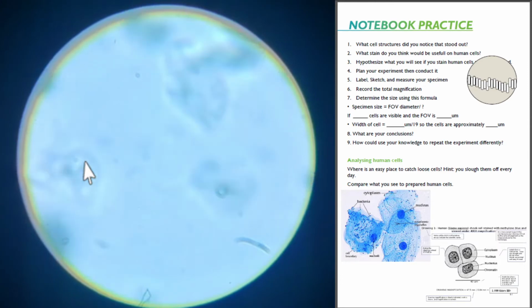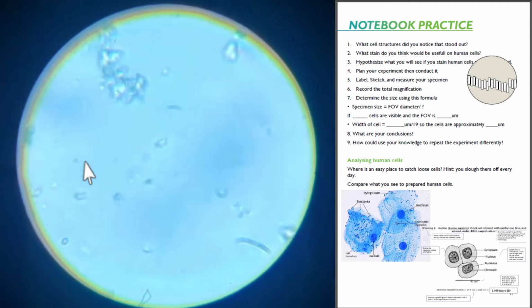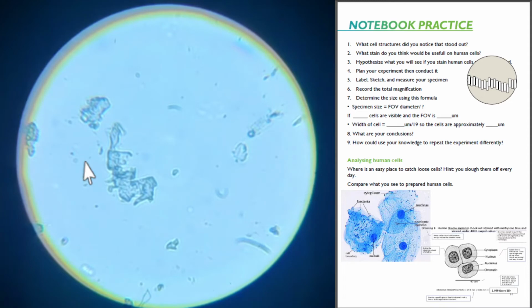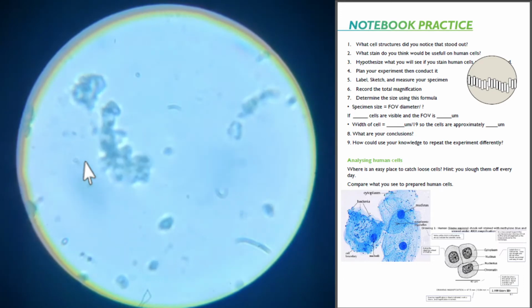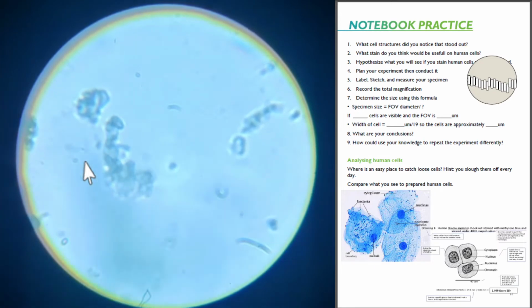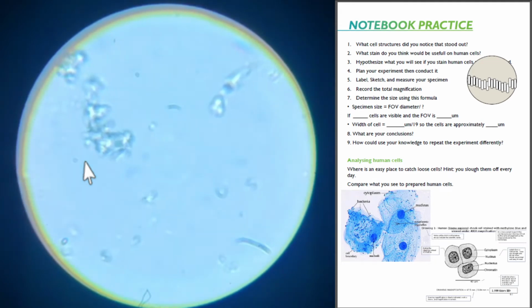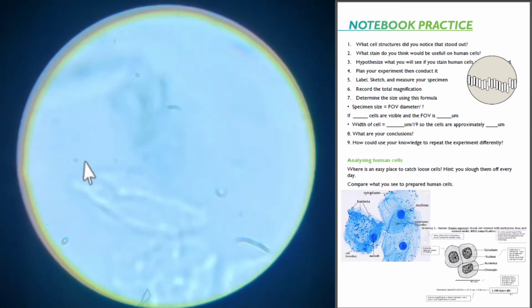What do we have here? Oh, I missed. I lost it. Oh, did you see that? What have I been eating? It's like Jaws down in there. So you'll see some movement of things because of the water. But you might actually see organisms. Your mouth is filthy.